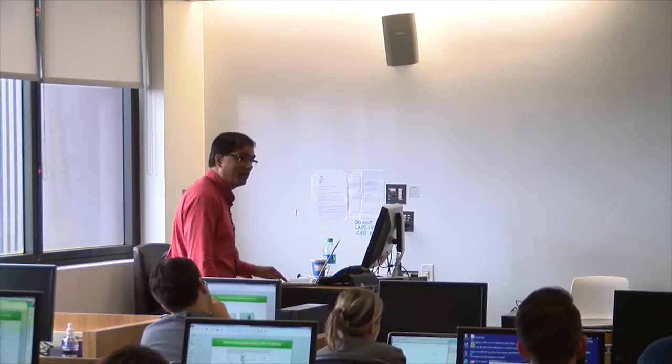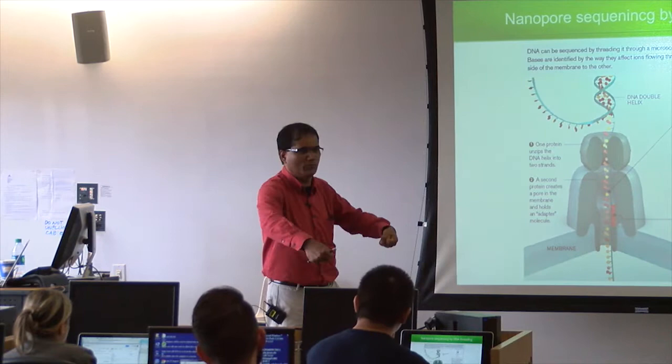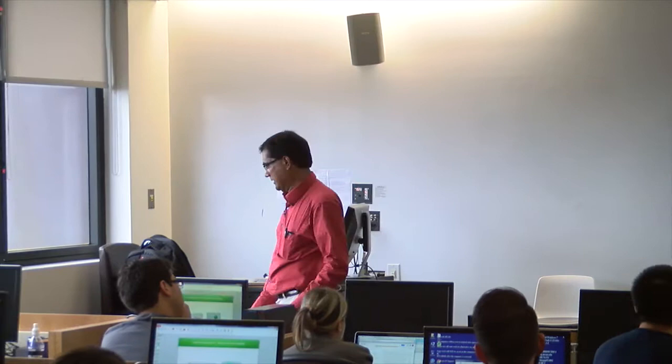How big is that instrument? You have seen the Illumina one, it is this big. PacBio, from there to here, huge machines, you can't move. Three or four people have to move it from one bench to another, huge, big. How big is this? This big? You have to pass through the entire DNA. Even if you're passing the chromosomal DNA, it should be huge, right? It should be big, right? So if you look at the size, how do you hold that?